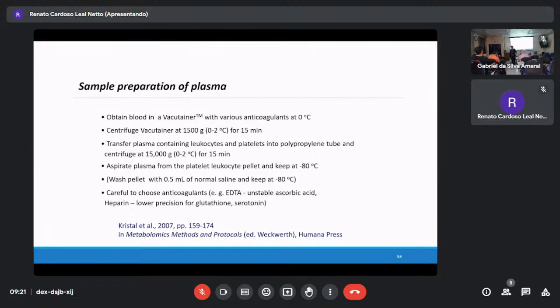For example, protein has a lot of NH and COOH, so the compound is tightly bound there. If bound to the protein, it cannot be detected in the NMR spectrum, or it shows up as a broad spectrum. So that's why there are two reasons to remove protein: first, the signal of protein in the NMR spectrum and multi-charged material in mass spectrum; the second is conjugation, interaction with the molecule. For that reason, we remove it.